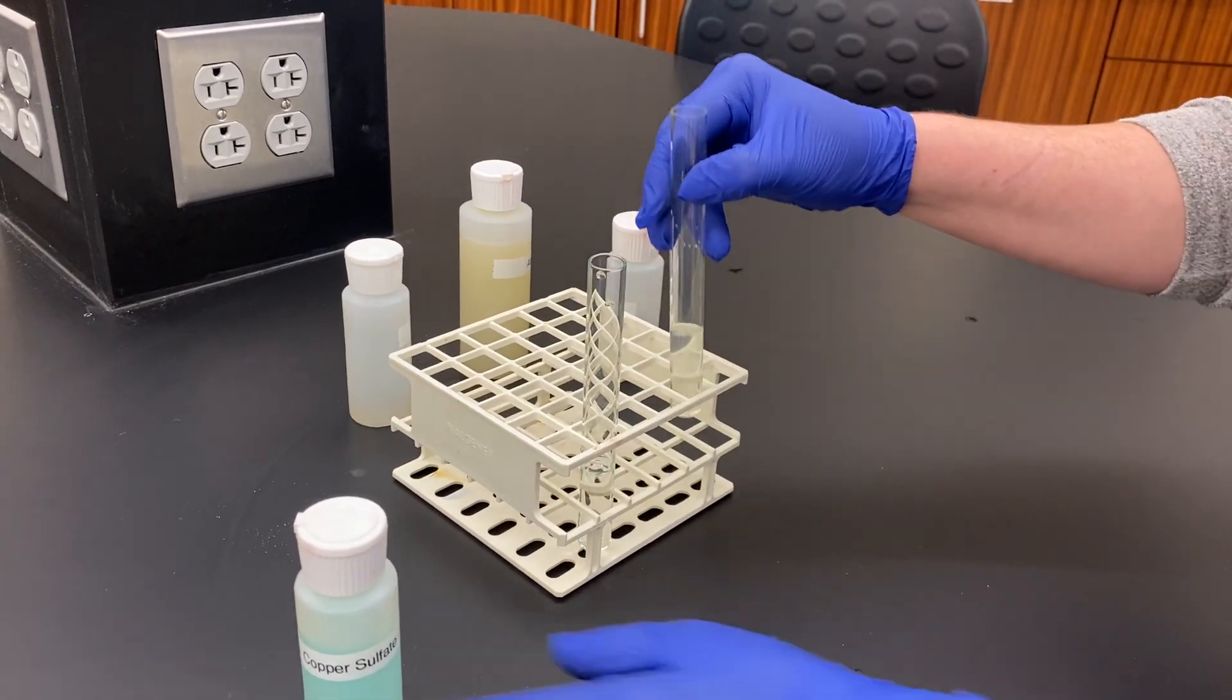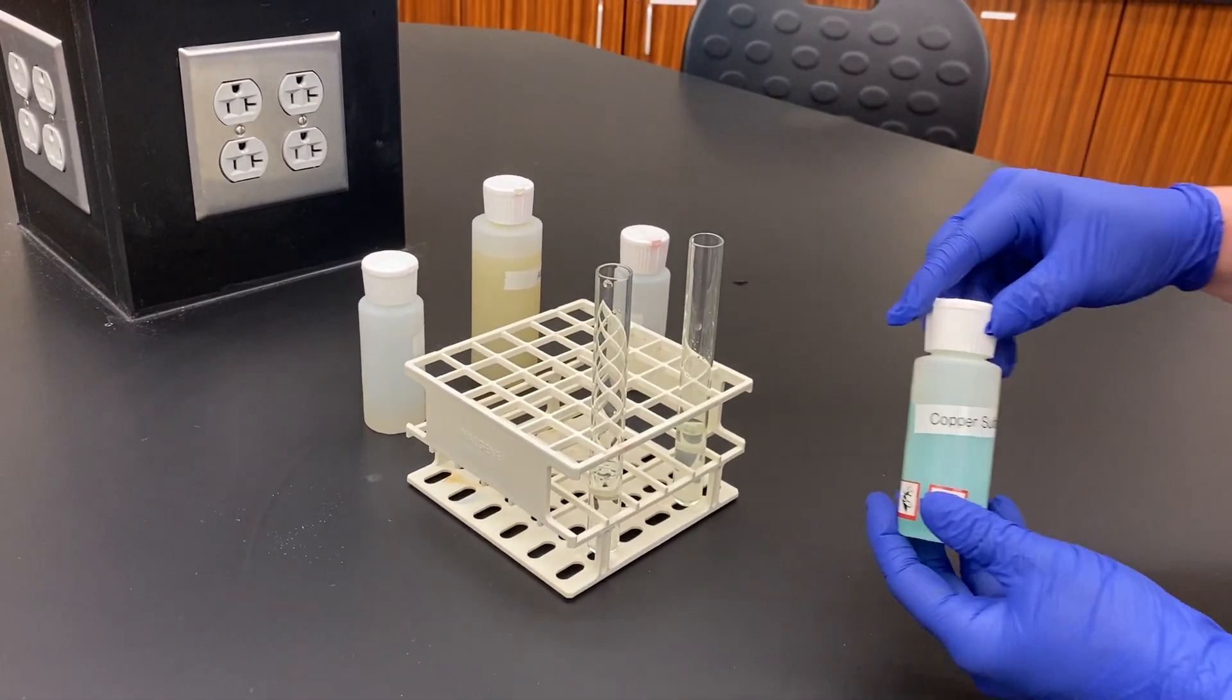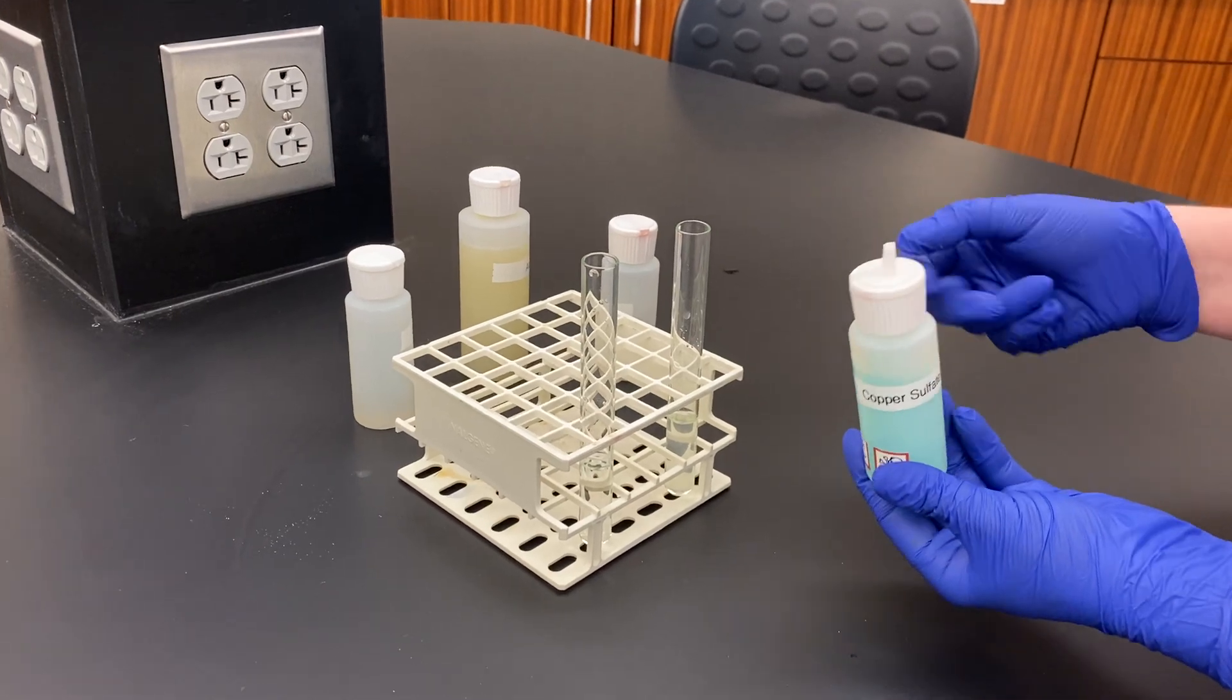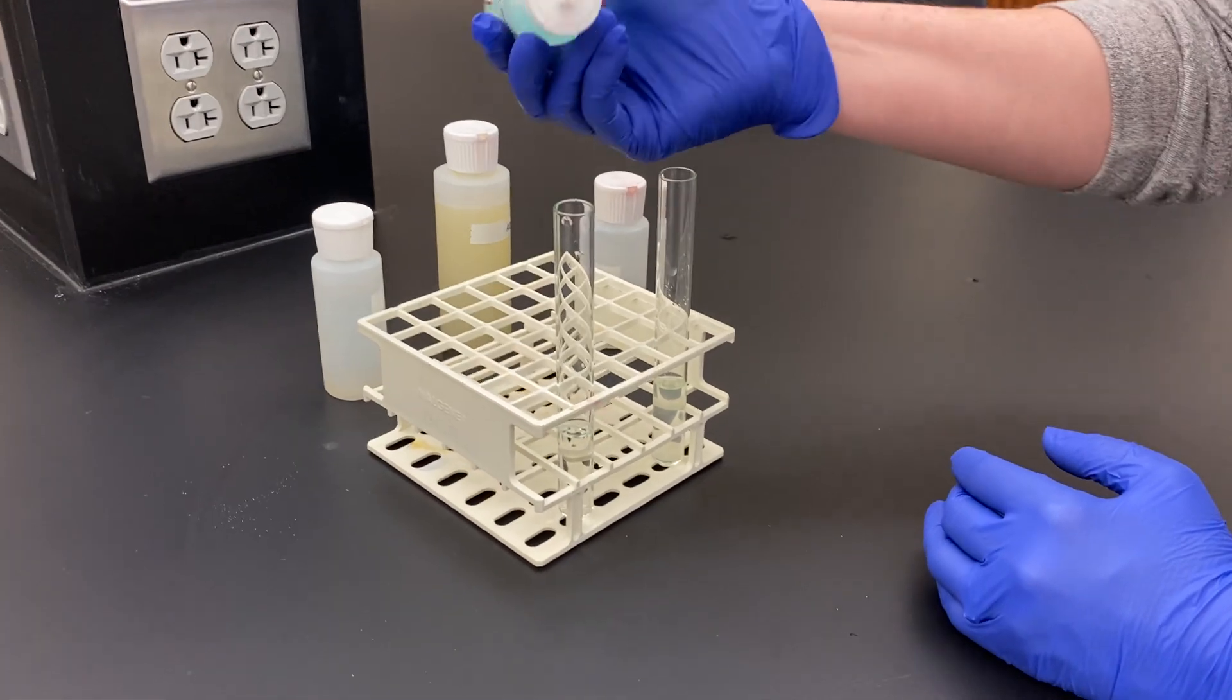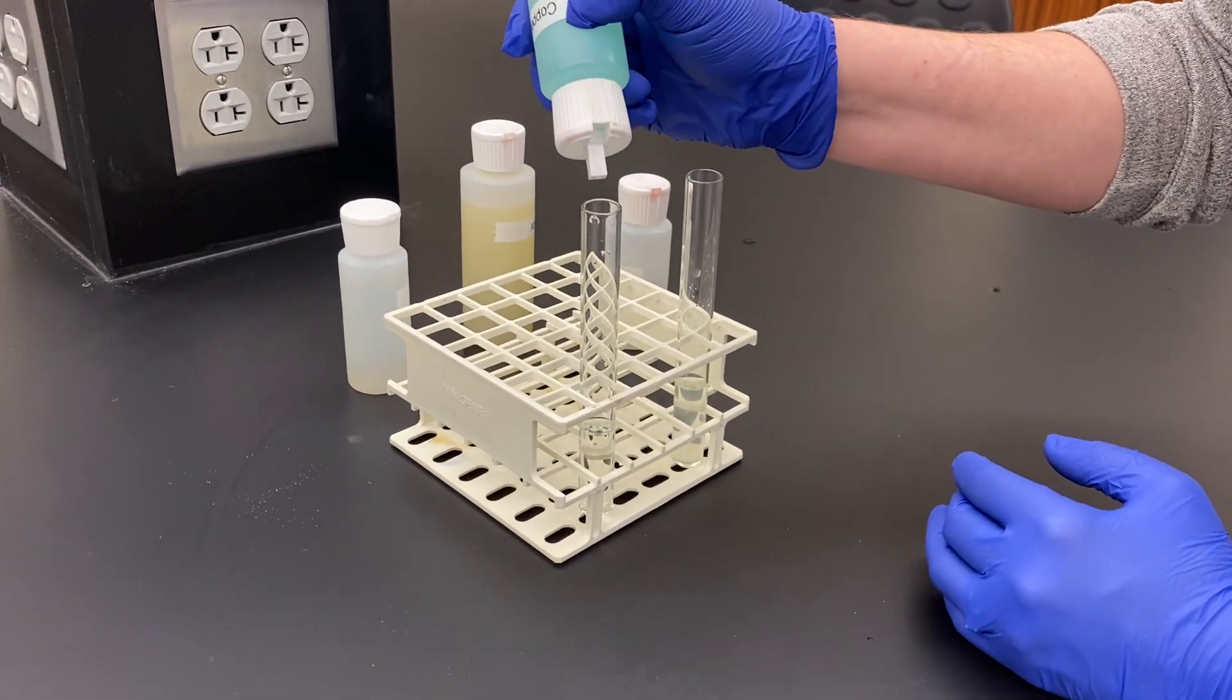And now we're going to add the copper sulfate. If this reacts with proteins, you're going to see a purplish pink color. And if there's no proteins present, you should see a blue precipitate forming.